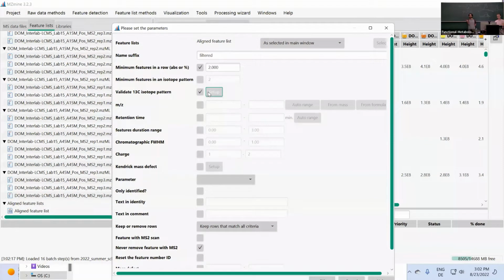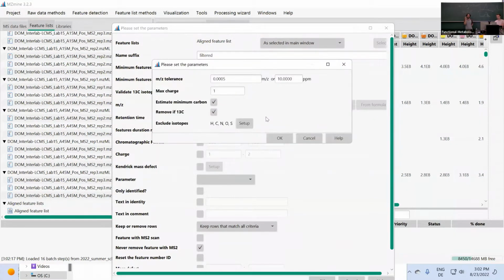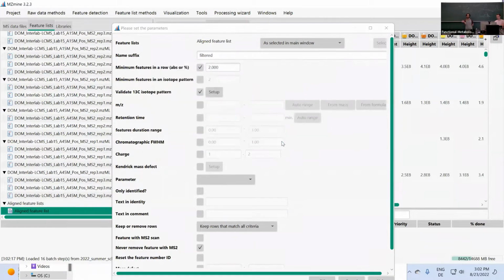So if you have triplicates, you can think that in at least 2 of those you will want to have the feature detected, right? And also the samples themselves are kind of similar. They are from one analysis trip to the ocean, got some water, so it's at least the same type of sample.